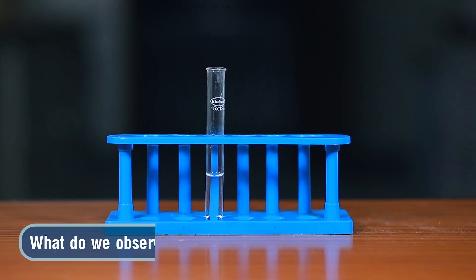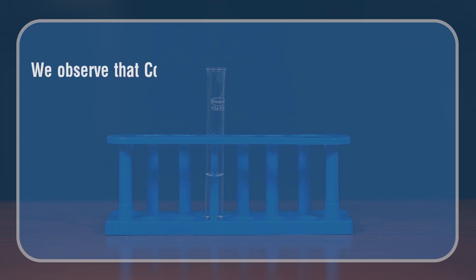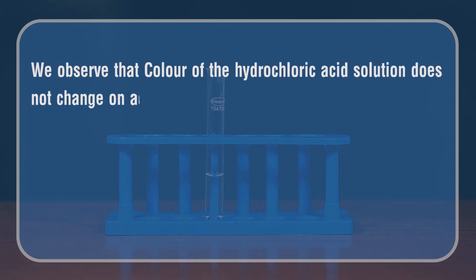What do we observe? We observe that color of the hydrochloric acid solution does not change on addition of phenolphthalein indicator.